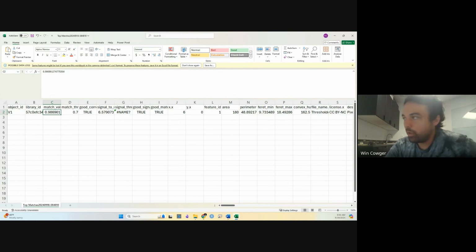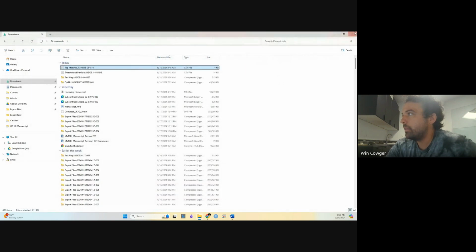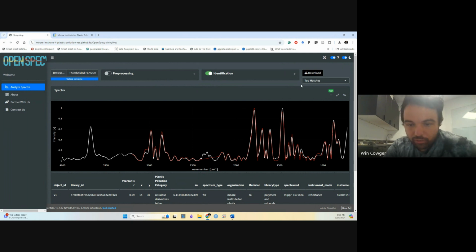Okay, not hearing any questions. That's good. So in this last 10 minutes, I'll show you the other way that I more commonly do this analysis. Oh, okay. How do you download the updated file? Okay, so I think you're wondering about the final file that has all of your data in it.